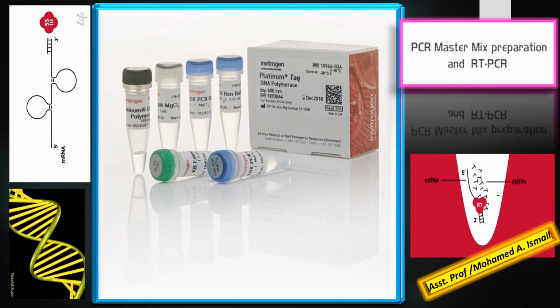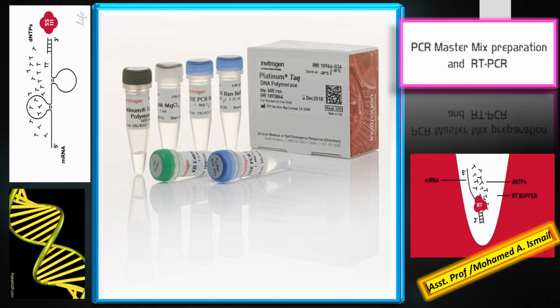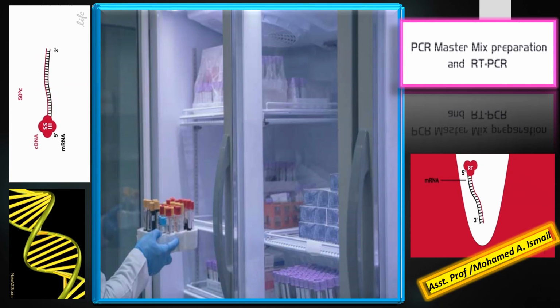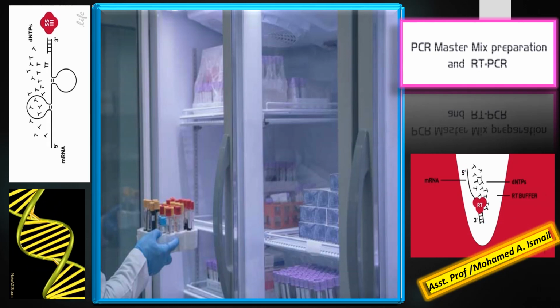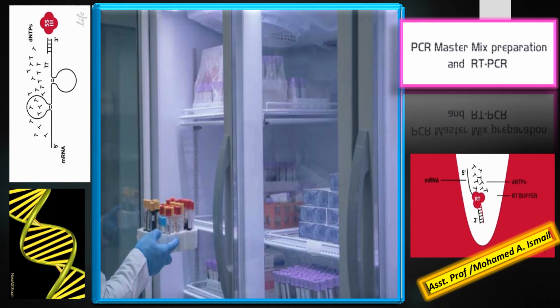From the reagent stock solutions, primers and probes should also be prepared and stored at -20 Celsius.